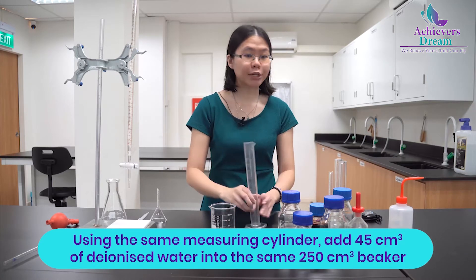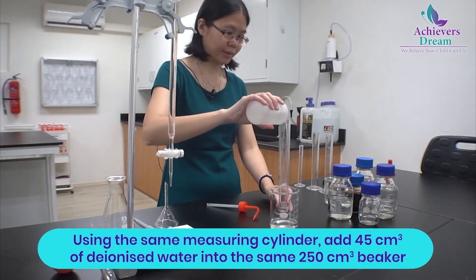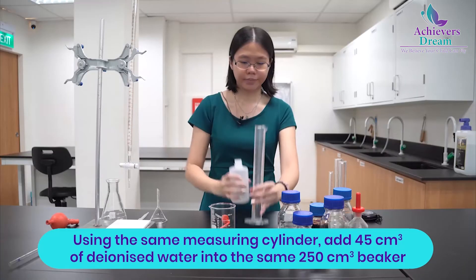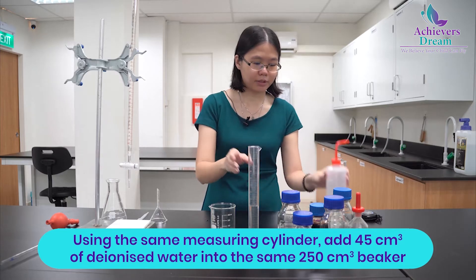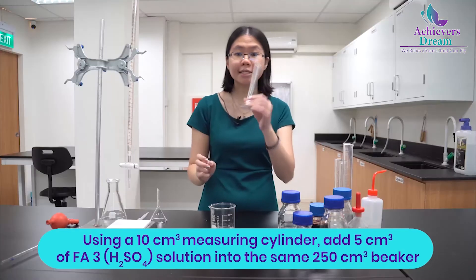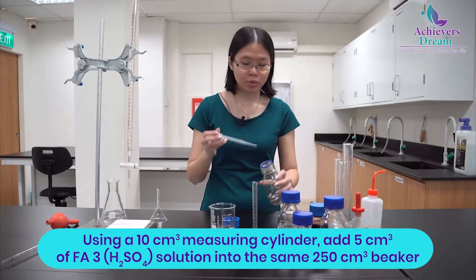After that, using the same measuring cylinder, measure 45 cm³ of deionized water and add it into your beaker as well. Then, using a 10 cm³ measuring cylinder, measure around 5 cm³ of FA3, which is your sulfuric acid, into the beaker.